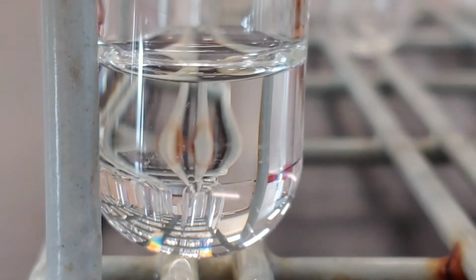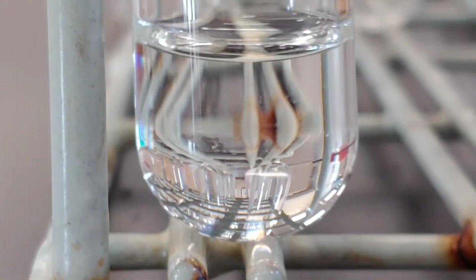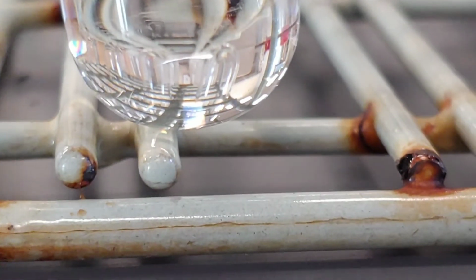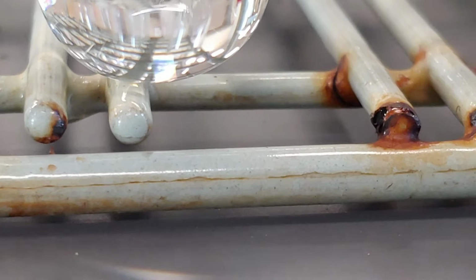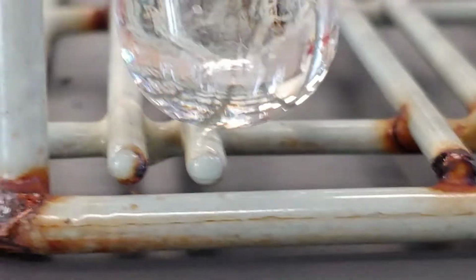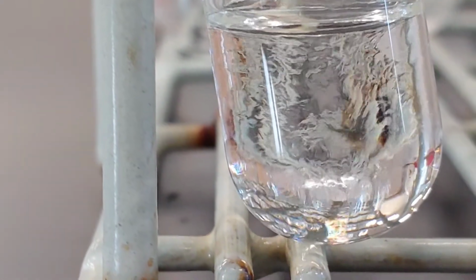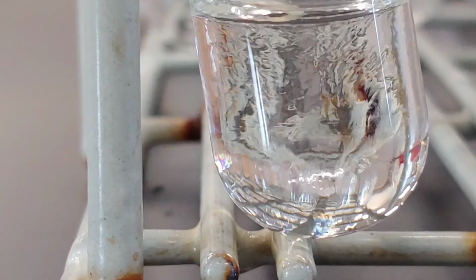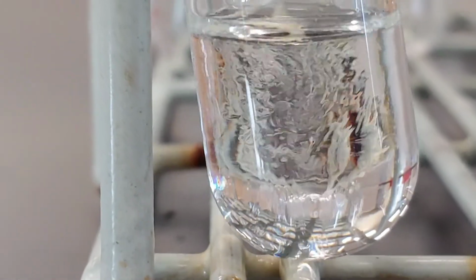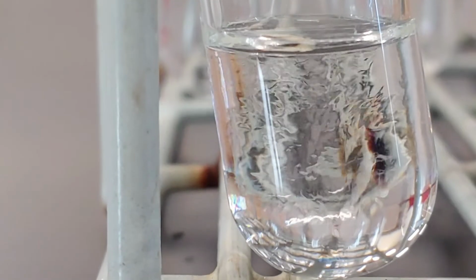Okay, reaction number 9, hydrochloric acid plus sodium hydroxide. There you go, okay. You can see the two solutions mixing.